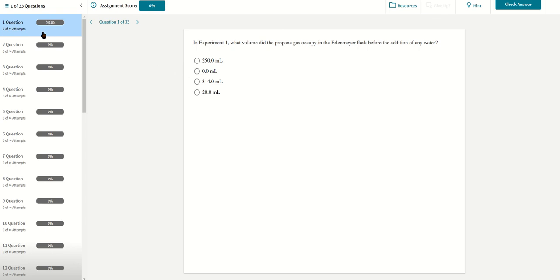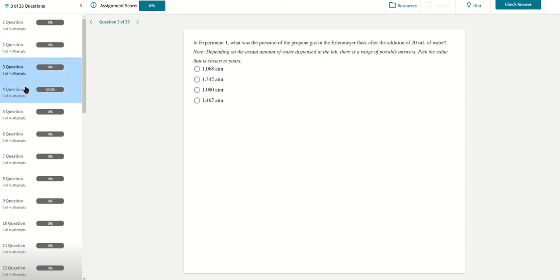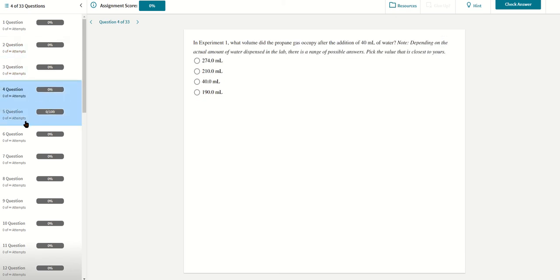Okay, so you did hopefully record all your measurements, and once you finish both experiments, at that point you're ready to do the lab assignment, right? So this lab, you do have measurements. The previous lab that you worked on, pH indicators, was super qualitative, but this one you are recording some measurements, so keep that in mind to the correct sig figs.